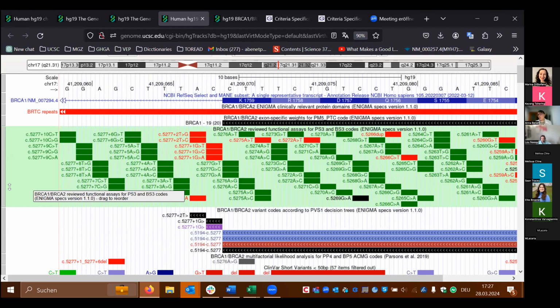And then, of course, if you want to know the code, we can only display here the codes that are in tables, or the variants that have been assigned. Just looking for a gene and a code, you won't get the variant that is associated to that code.